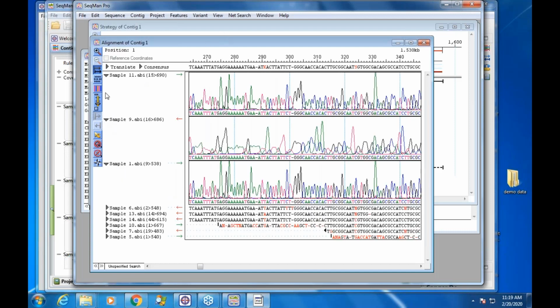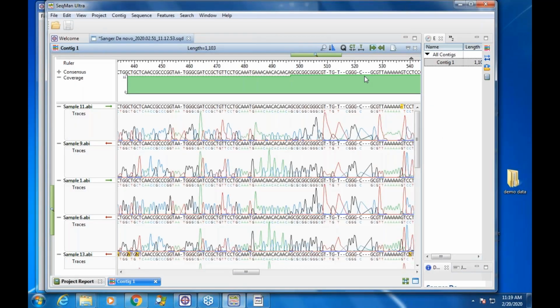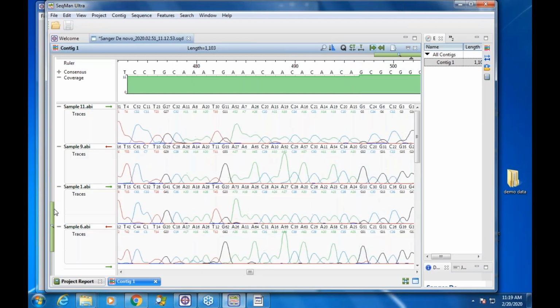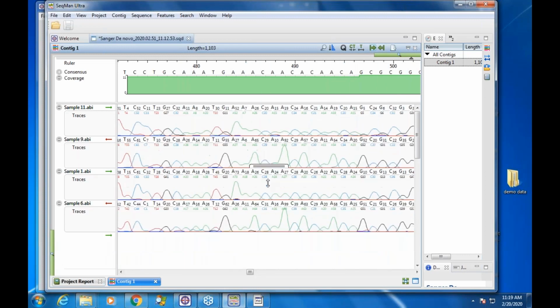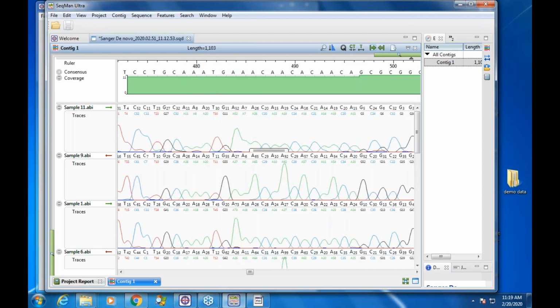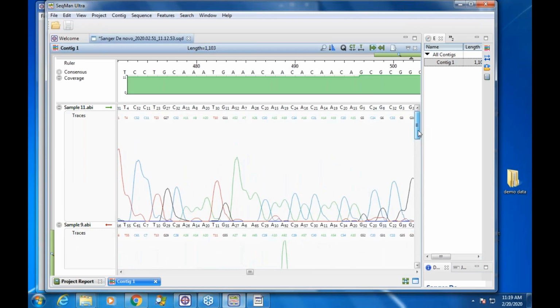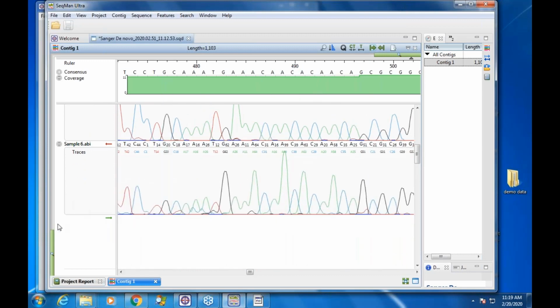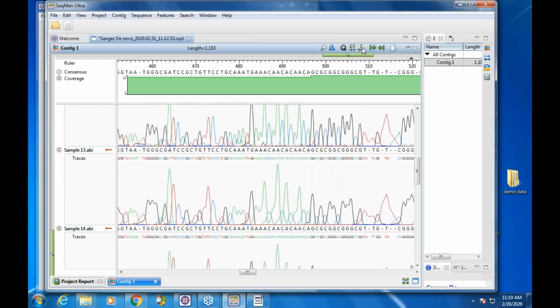We have a toolbar in SeqMan Pro where I can look at things like quality scores, right? We have something comparable in Ultra, where I can show scores. In Ultra, I can also, if I really want to make the peaks as big as possible, use a vertical zoom scale, and also these data tracks. If you hover in the center of them, there's a grabber that allows you to make the peaks as large as you want. Okay, and then you can restore it back to the default. And so there's our default view.